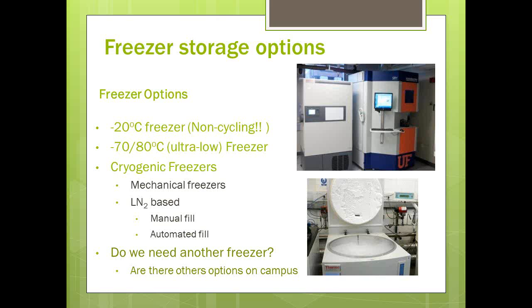Freezers, while we're not paying for electricity ourselves directly, use a lot of electricity. I've heard that the Shelby building is the worst violator of electrical use. We've got a lot of freezers in that building. So really think through, is there a place that I can hook up with to store my samples?